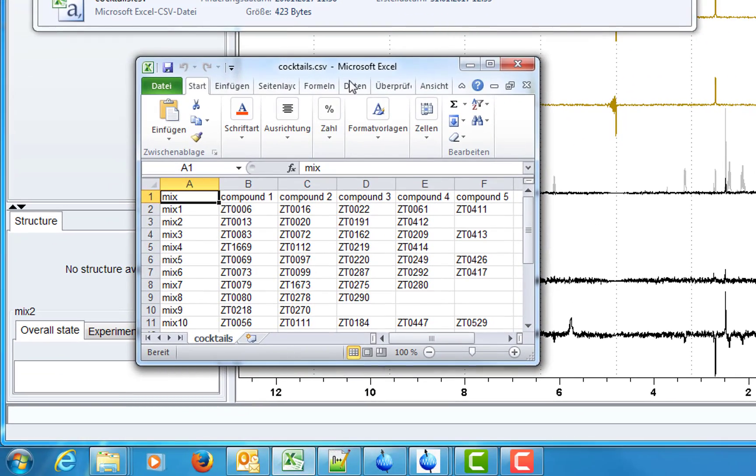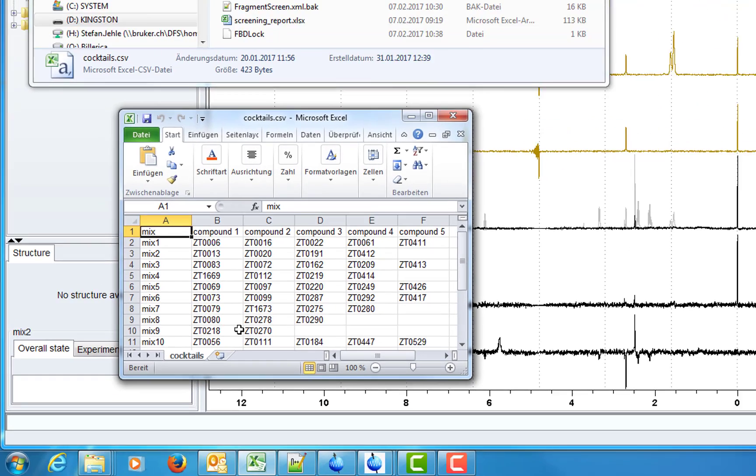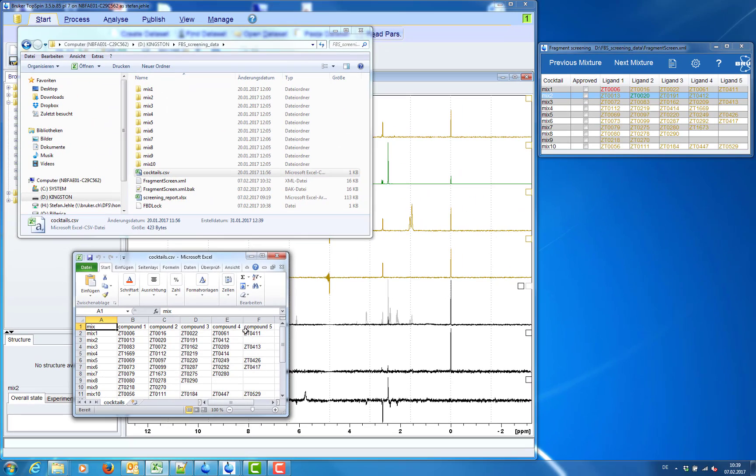The COCTAS file is a semicolon separated CSV file that can be viewed in Excel. On the left-hand side we have the mixtures and on the right-hand side the compounds that are pooled in the mixture.